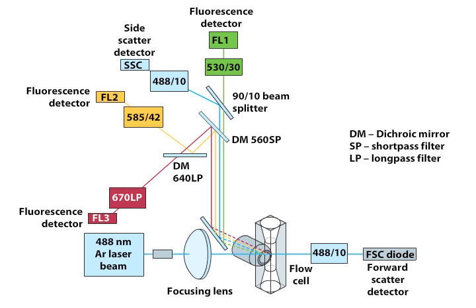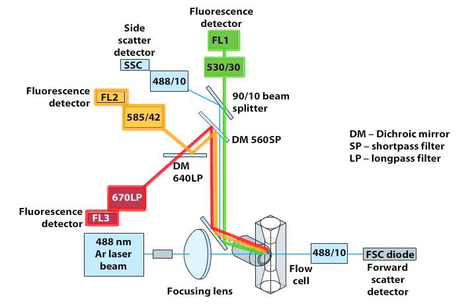However, in addition, some of the incident light interacts with fluorescent dyes bound to surface antigens on particular cells and is re-emitted as fluorescent signals at a wavelength characteristic of each fluorescent dye. The fluorescent light coming from labeled cells moves through a series of filters and mirrors so that specific wavelength ranges are delivered to the appropriate detectors.